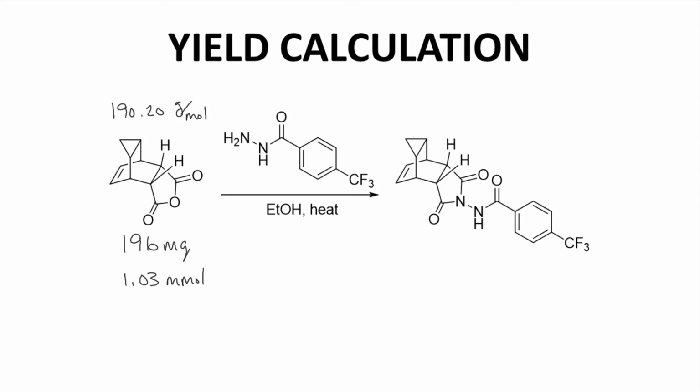For the hydrazide, we used 198 milligrams based on a molecular weight of 204.15 grams per mole. We used 0.970 millimoles of the hydrazide.